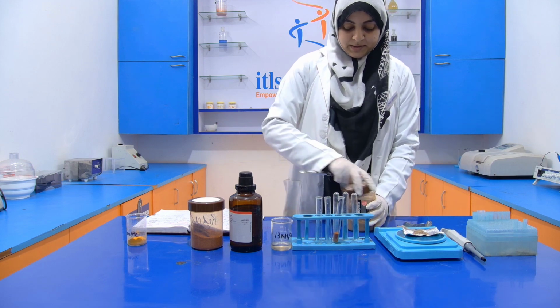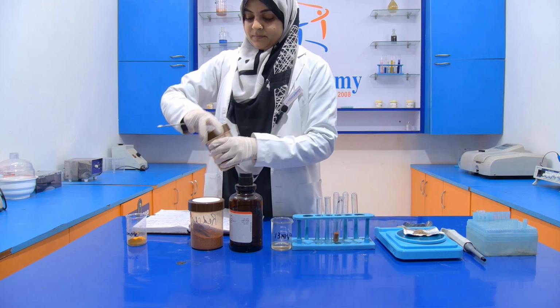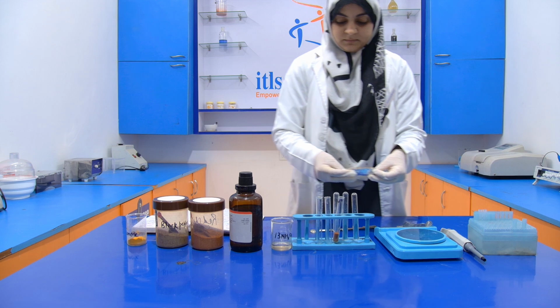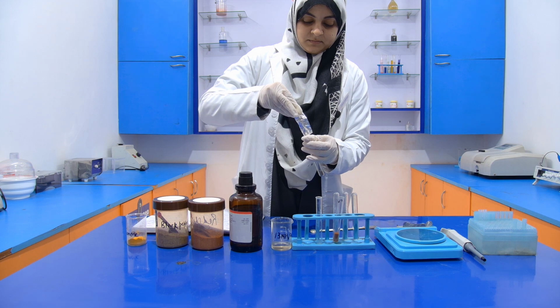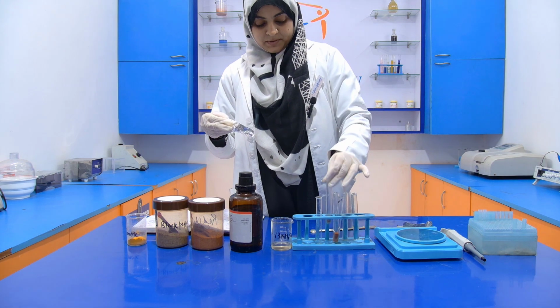Now it is 1 gram. Now transfer this into a second test tube. Transfer it very carefully. So this is your black pepper.